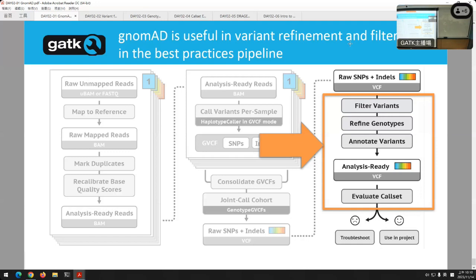I think clinicians generally do consider other mutational consequences depending on what's known about the disease. So some diseases are specifically caused by loss of function variants and some are not. A clinician would take that into account when deciding which variants to look at. I was really just illustrating in the browser that you can choose which variants you are most interested in, but you could certainly also select missense variants for that.